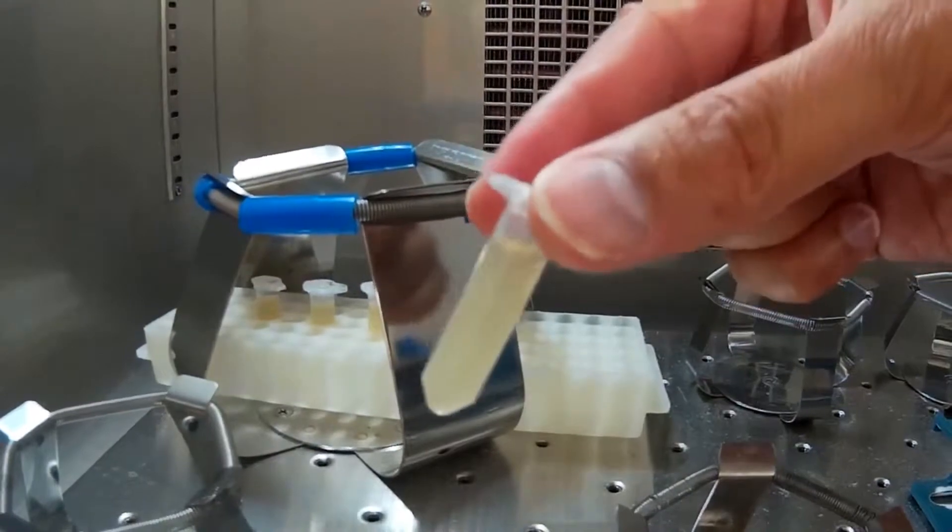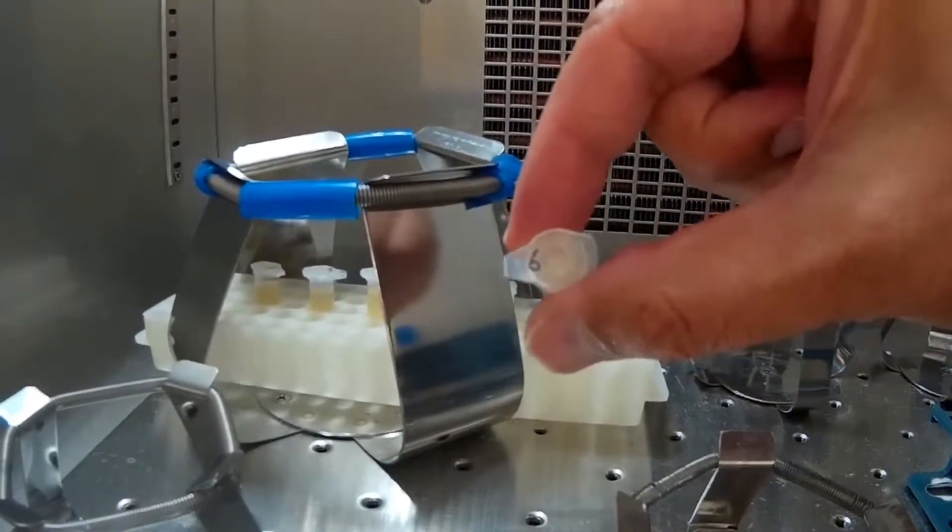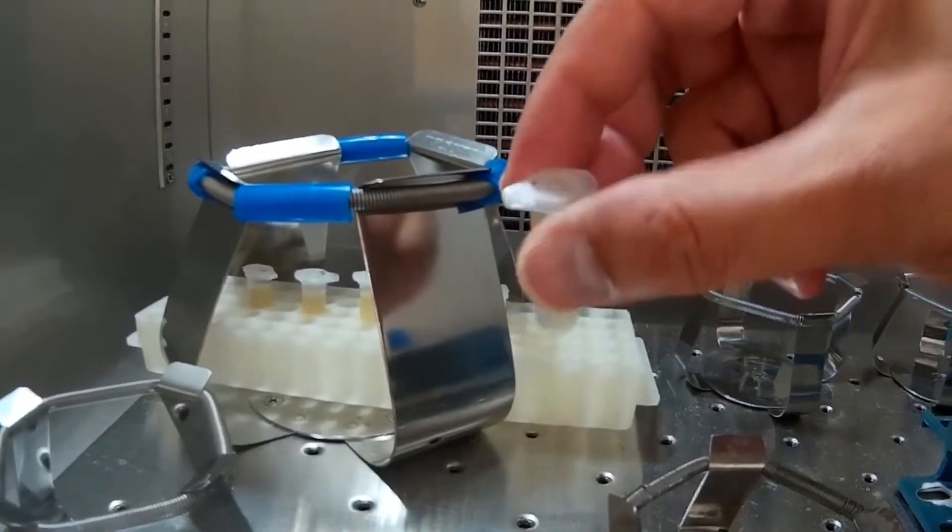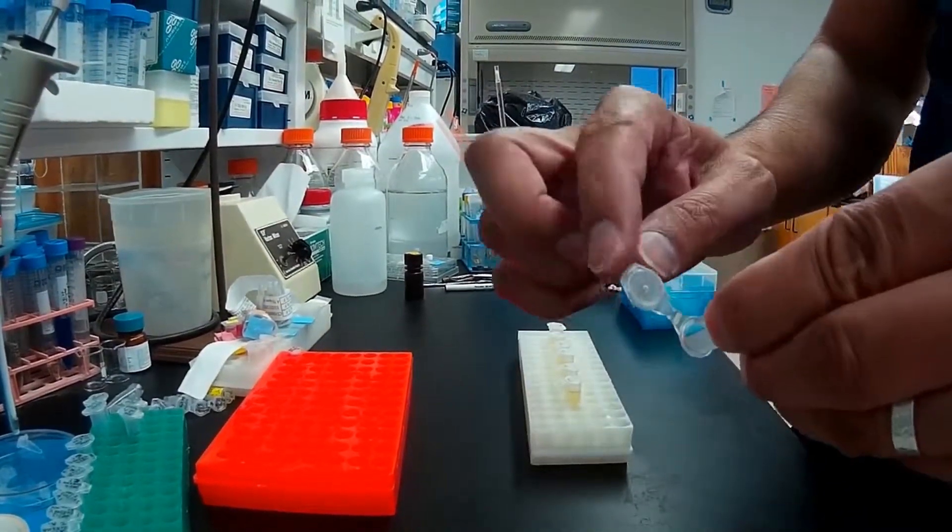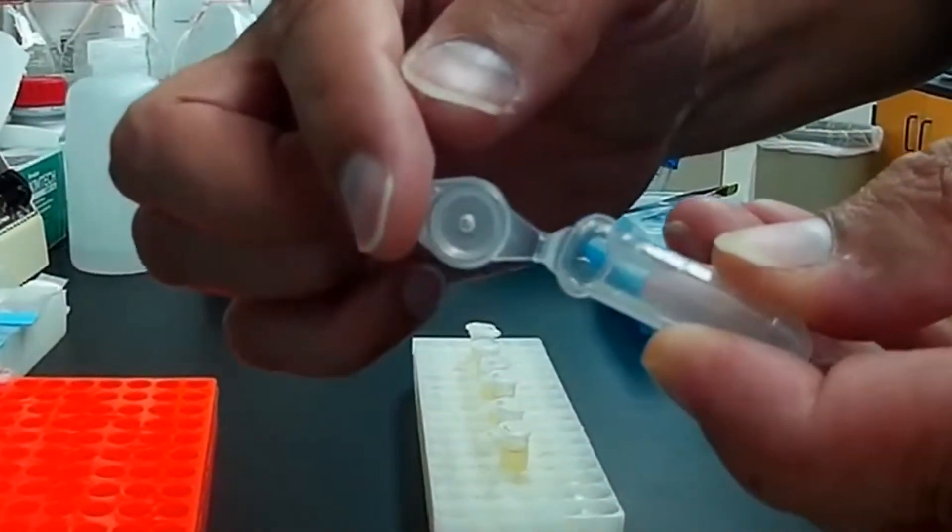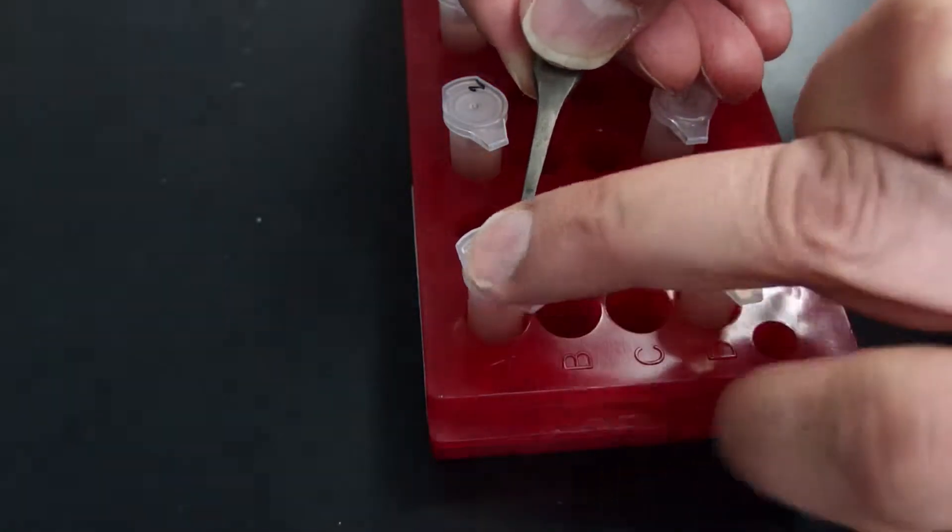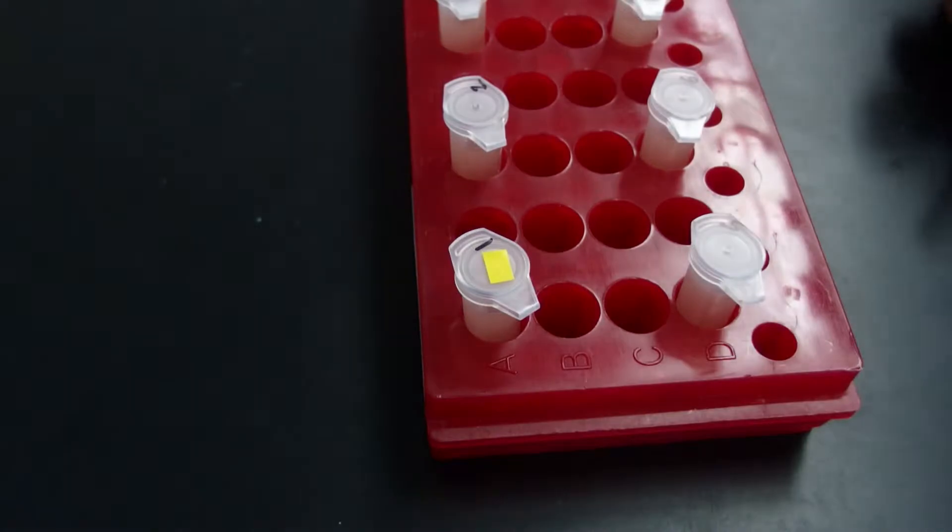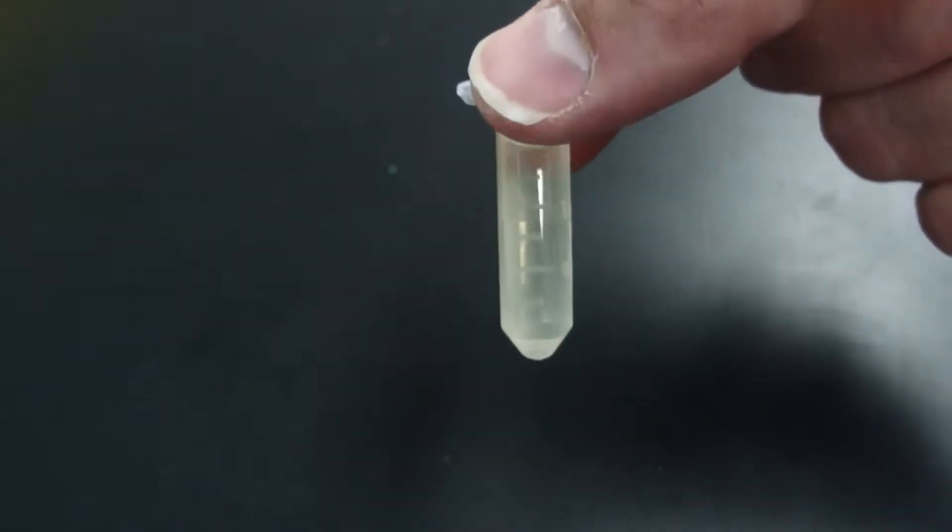To save time and plastics, cultures can be grown directly in two milliliter tubes with a small hole poked in the top. The hole can be poked in the lid with a 26 gauge needle. This allows the culture to breathe. Optionally, the hole can be sealed after the culture is grown with this little piece of tape. Don't worry about cross-contamination. Nothing grows in an un-inoculated tube even after one week.